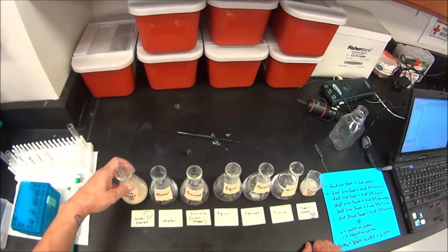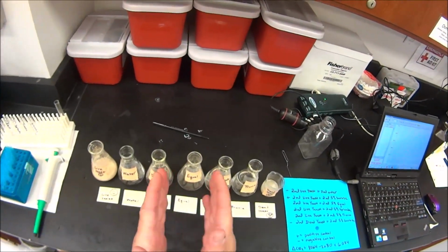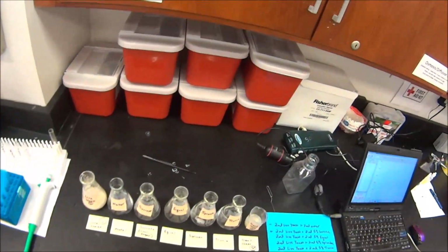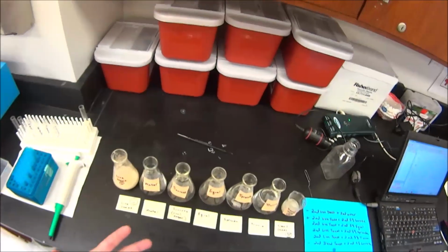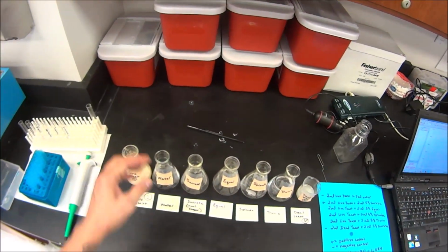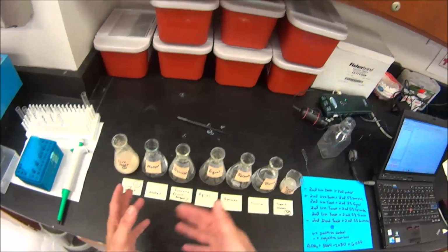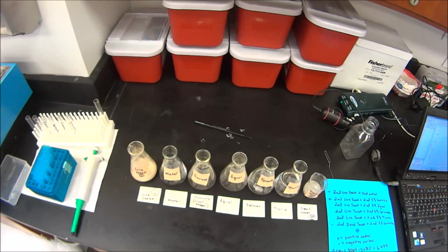They're happy. Okay, so since we don't have human cells that we can work with and measure their cell respiration, when our cells respire, they produce a little CO2 waste and they make some energy. Well, we don't have human cells, but we do have live yeast cells, and yeast can ferment sugar anaerobically, and they will produce CO2 as a byproduct as well.